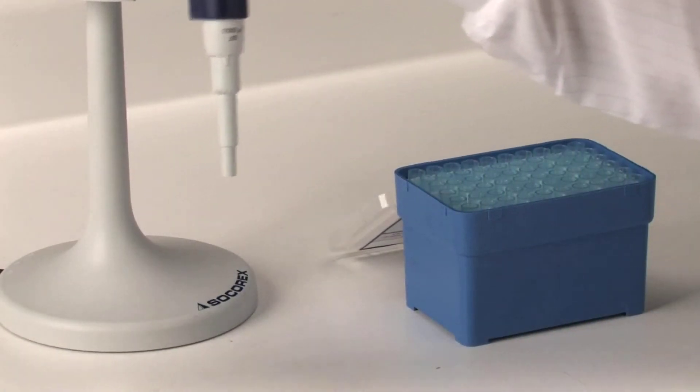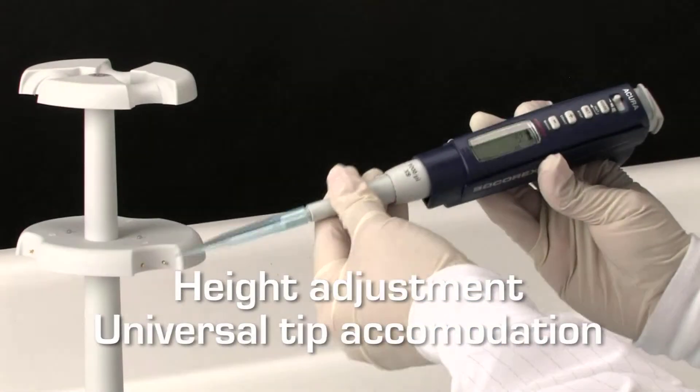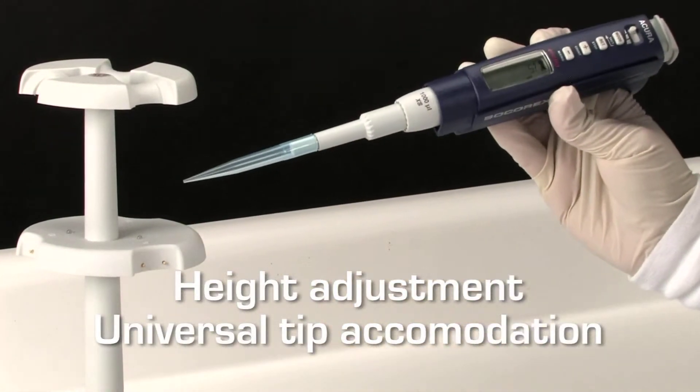Acura Electro Pipettes fit the most popular brands of disposable tips. The tip ejector is adjustable within a 4 mm span, simply by turning the ejector sleeve.